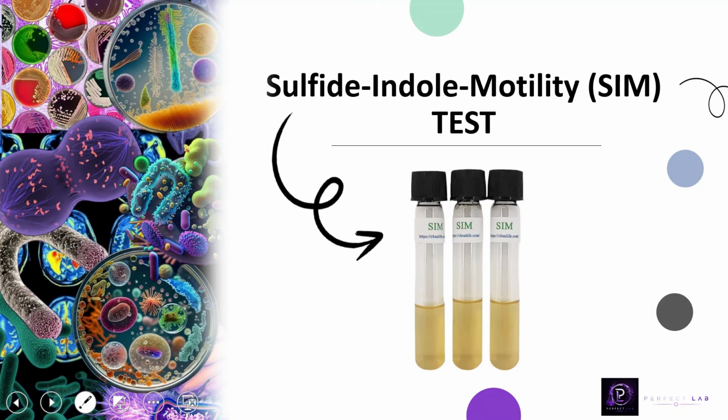In today's video, we will be learning about the SIM test, which is an important biochemical test used in microbiology to identify bacteria based on three characteristics: hydrogen sulfide production, indole production, and motility. In this video, I will also explain the principle of the test, the medium composition, and demonstrate the procedure step by step and show you how to interpret the result accurately.